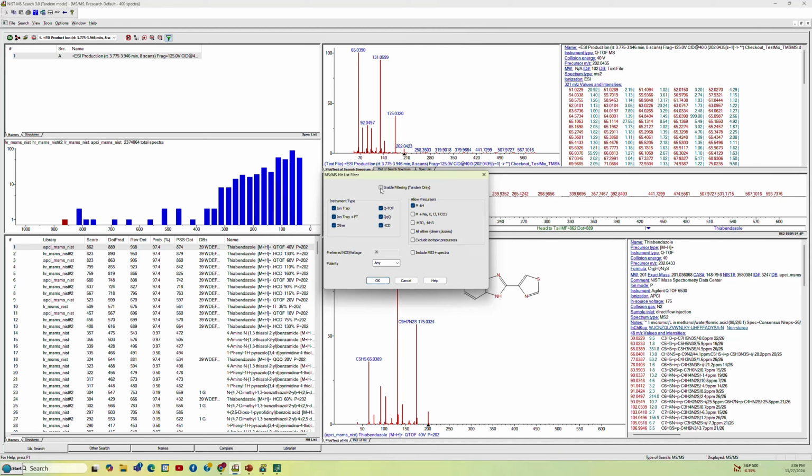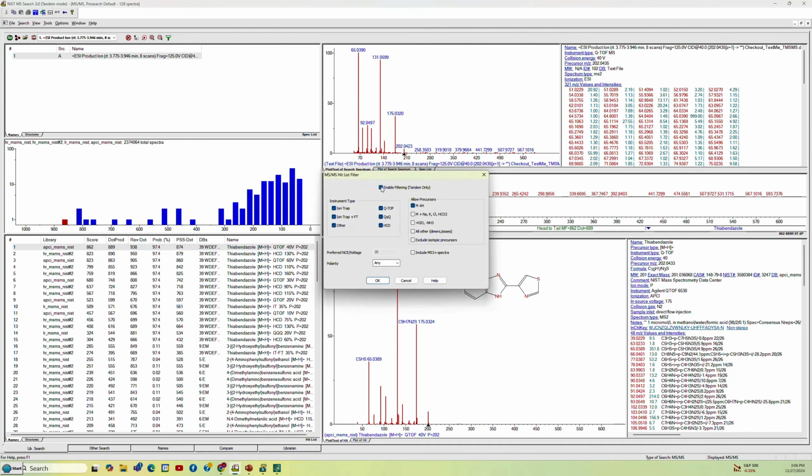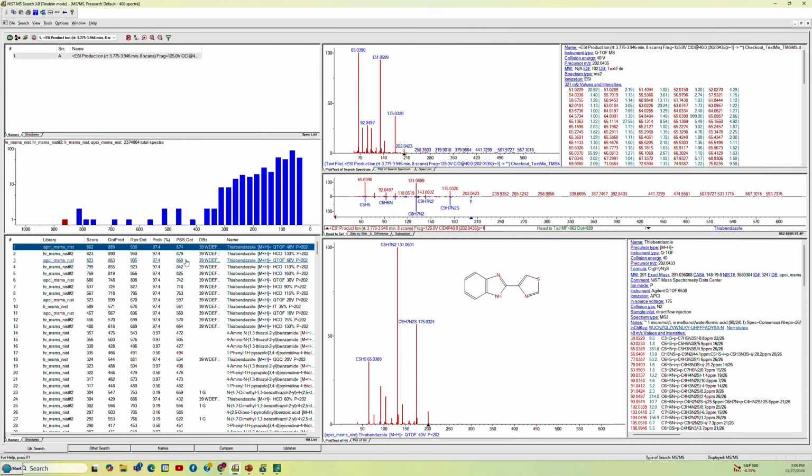So you can say, okay, if you enabled it, you can say, okay, and it'll sort it again using those limitations. But again, I usually keep this off when I'm through, just so when I do another search, it doesn't overlimit the search and get no results. So I keep those wide open initially. So that's pretty much the search.